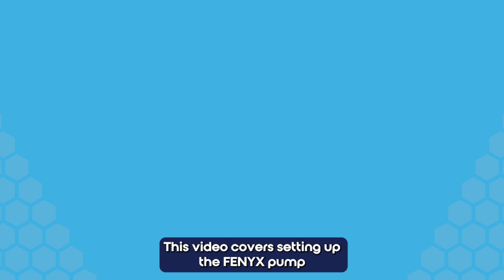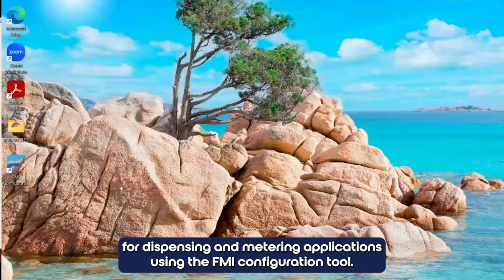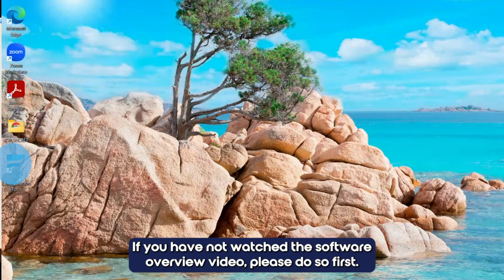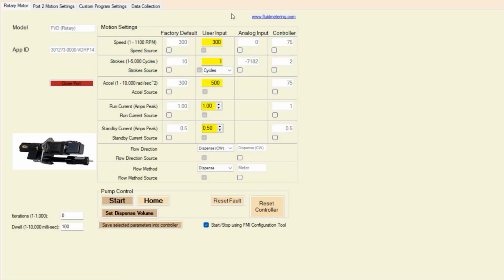This video covers setting up the Fenyx pump for dispensing and metering applications using the FMI configuration tool. If you have not watched the software overview video, please do so first.